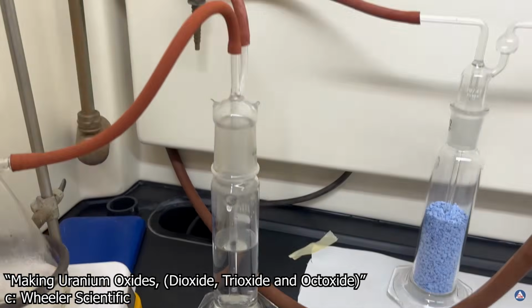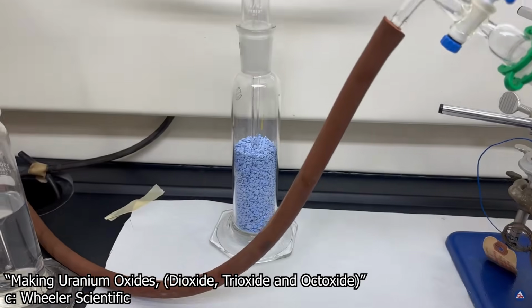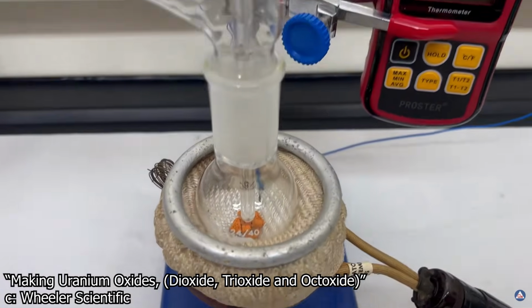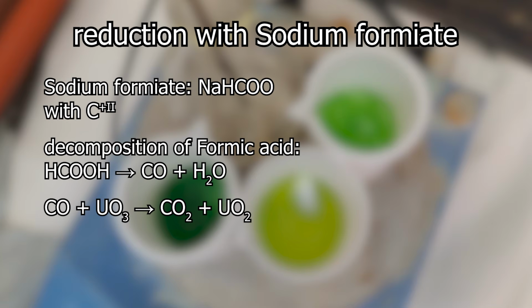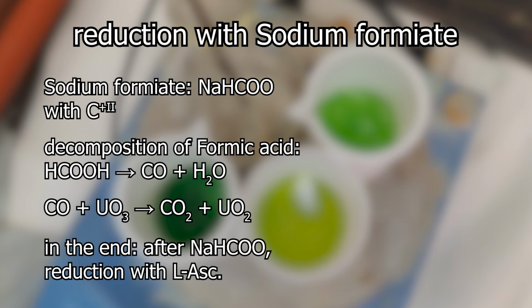You can also see a reduction of hexavalent uranium using pure carbon monoxide gas on Wheeler Scientific's YouTube channel. However, this decomposition of formic acid only occurs in highly hygroscopic agents such as concentrated sulfuric acid. These conditions do not apply to our system. Carbon too can reduce uranium, just not in the form of plain old sodium formate in aqueous solution. Accordingly, I added L-ascorbic acid to ultimately extract uranium tetrafluoride from this as well. These sodium ions will also cause us some problems, but I'll get to that when evaluating the PXRD data.